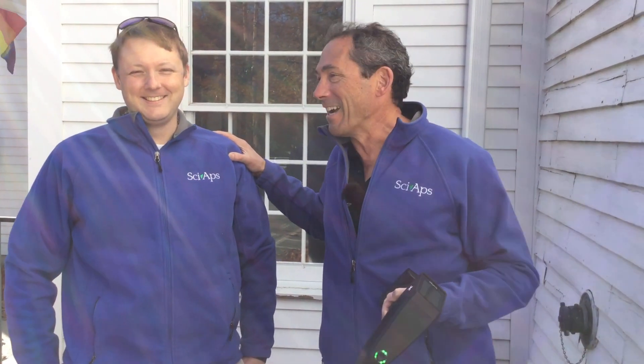Hey, I'm Don Sackett, CEO and co-founder of SciAps, and I'm here with my chief scientist. We always like to wear matching clothes. My chief scientist, Brendan Connors, who invented our lead paint algorithm that we're using in this XRF.